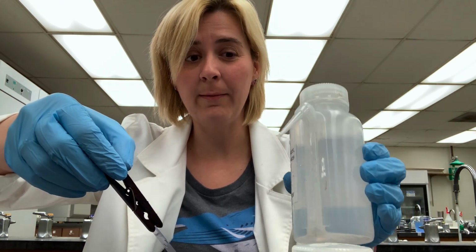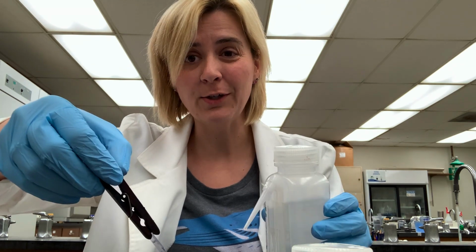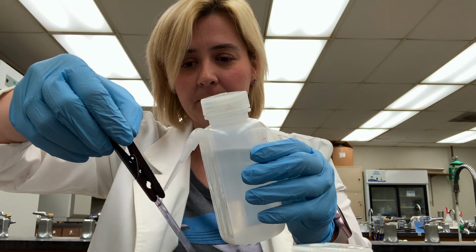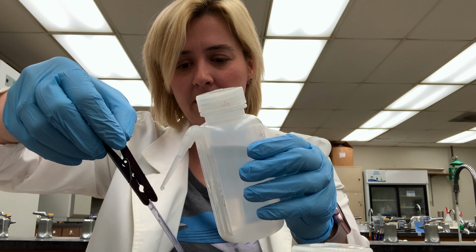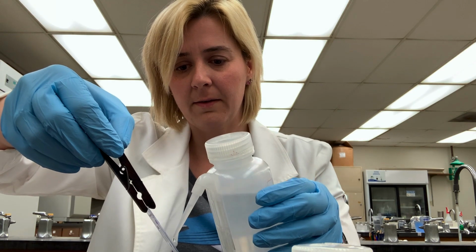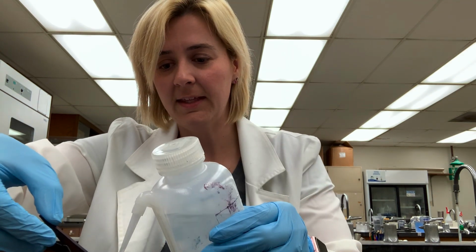So very carefully, what we do is slowly drip ethanol down the slide until color stops coming off. And that should only take like between 5 and 15 seconds. There's still color coming, still color coming. Okay, it's clear. Then we'll rinse with water to get the alcohol off.